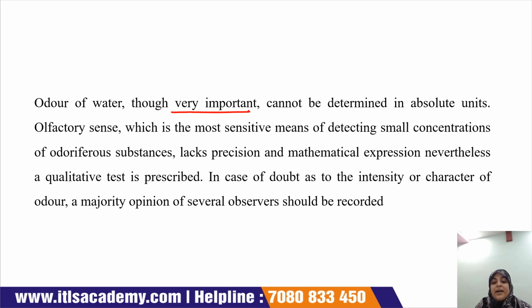It cannot be determined in absolute units. Odor is very important, but it cannot be determined by any unit. So for this we have to use the olfactory sense. This is the most sensitive method to detect the odor of the water.